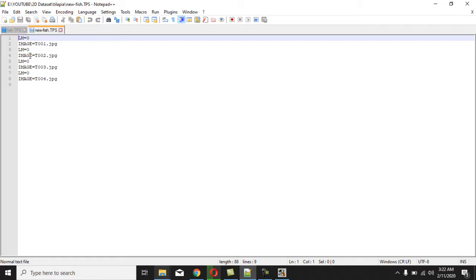Okay. So for now, we can ignore the former one. So we're going to use this. They are the same actually, but we want to use this. This one has the 4 images included. All right. So you can see that the ID is ignored here because it's not important. You can include it if you want, but you can ignore it as well. So let's see how to use this to digitize our image.